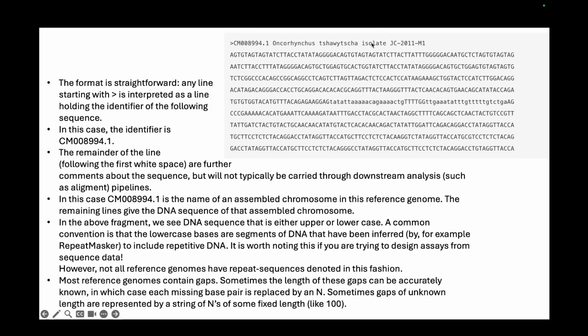So maybe they have isolated some part of the genome from this organism, that has been sequenced and that sequence is here, and maybe this is some other extra information that you have added. So the information that you are adding should be in the first line only, and after the first line, from your second line, the whole sequence will start without any gaps.